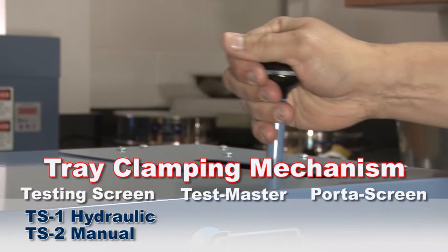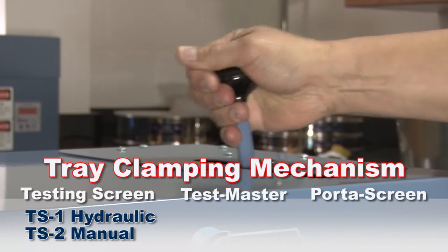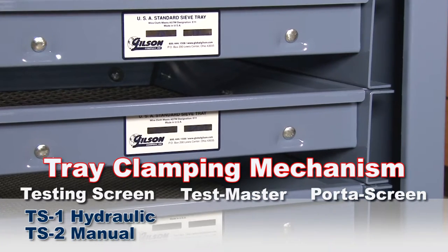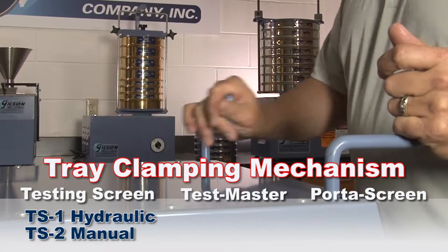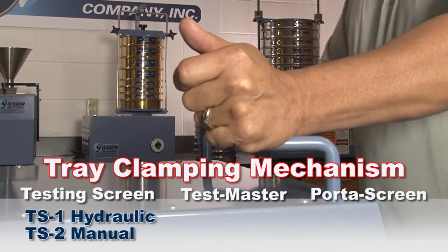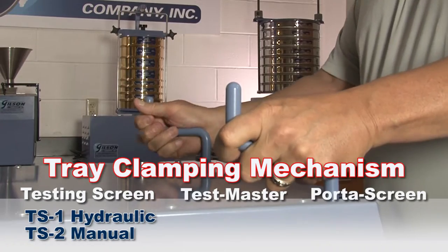The TS1 has a quick acting hydraulic clamping mechanism, and with a few strokes of the hydraulic pump handle the screen trays are effortlessly secured and ready for testing. Whereas the TS2 has a mechanical clamping mechanism which secures screen trays with a few rotations of the dual clamping rods.